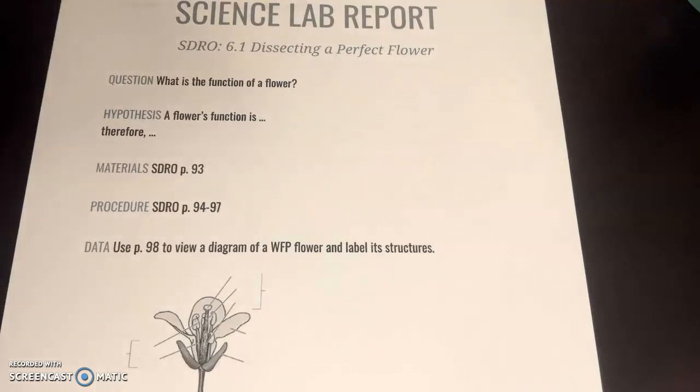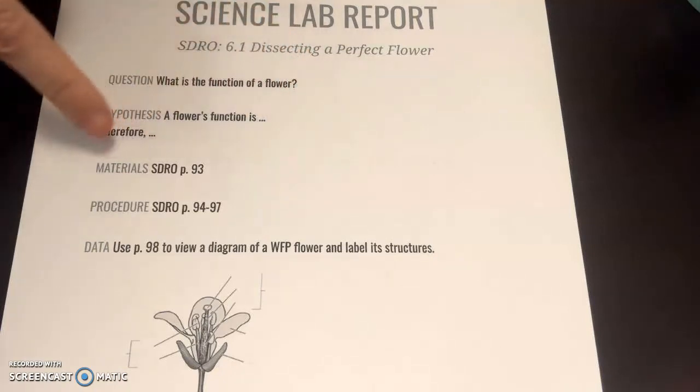In Inquiry 6.1, we're going to be dissecting a perfect flower. Our question for this lab is, what is the function of a flower? So for your hypothesis, you will make a guess as to the answer to this question. A flower's function is blank, therefore, or because blank.